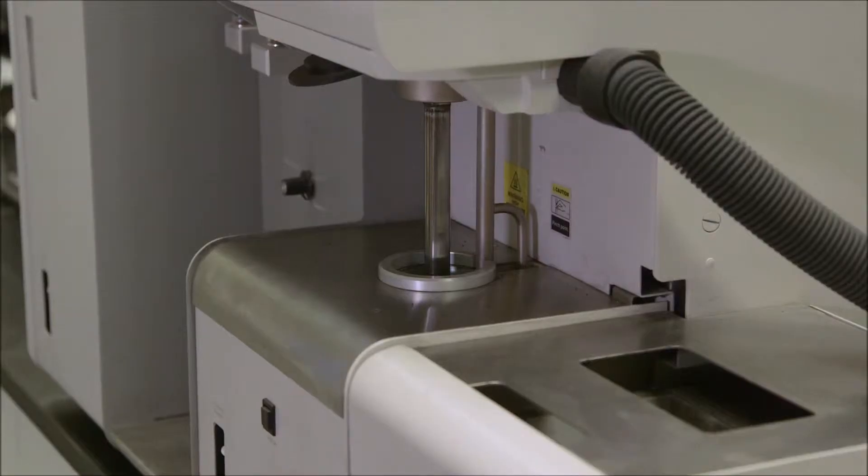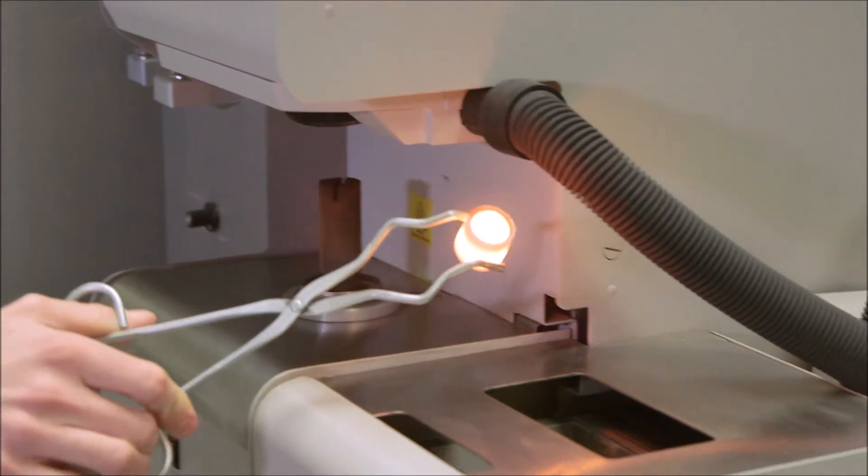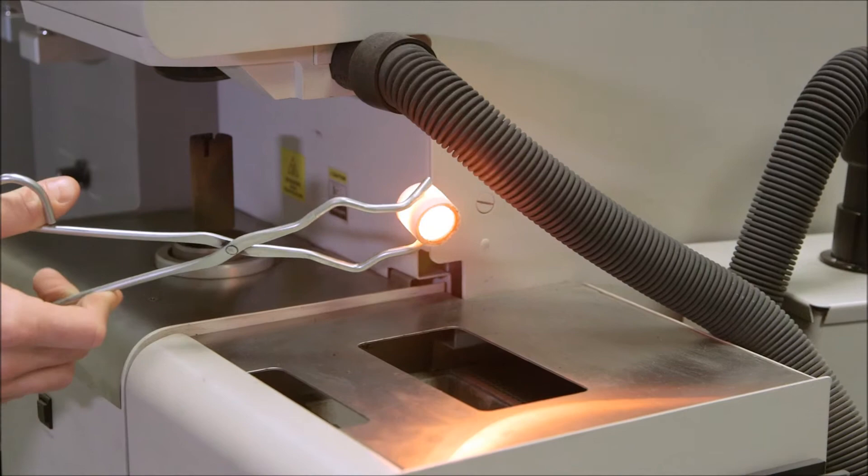There are cases where nitrogen contamination can lead to a dramatic failure in the field if our steels contain this high level of nitrogen.